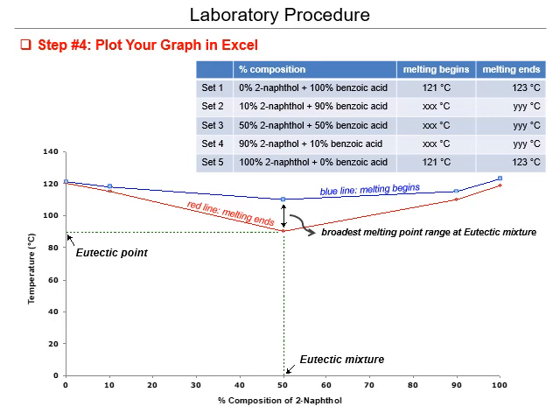Looking back at it with common sense, both of these molecules melt at 121 to 123, so they have a very, very similar melting point. If you have a mixture of two similar things, the 50-50 ratio should have basically the lowest melting point. It's just a common sense thing, and it matches with the data we have here.